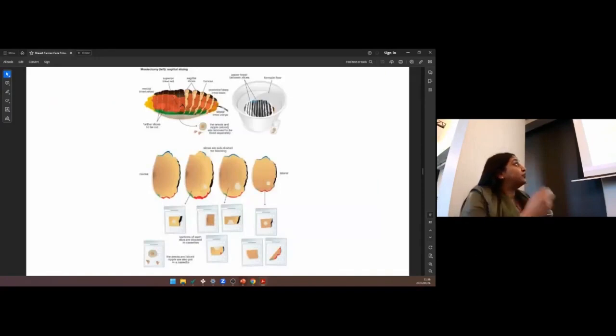Right, so we try and gross it as thoroughly as possible. And it's important that we put representative blocks of tumor into the cassettes so that we can assess the tumor in its totality. We also need to know if there is DCIS that is involving other quadrants of the breast. We are quite lucky or fortunate in the fact that the mammogram's already on the system and reported on by the time we actually get the breast samples.